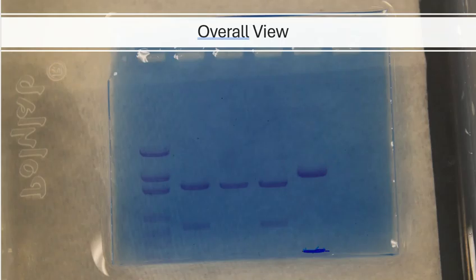Now, I realized after the fact that the picture doesn't quite do justice. We don't have a proper imaging system in-house, so I just kind of have to deal with the camera. And if the camera can pick them up, then great. Sometimes it can do that and sometimes it can't. And that's what you're seeing over here on the right hand side. I have drawn an extra little band here because that actually showed up in-house, but it does not show up quite well on the picture that I have taken.